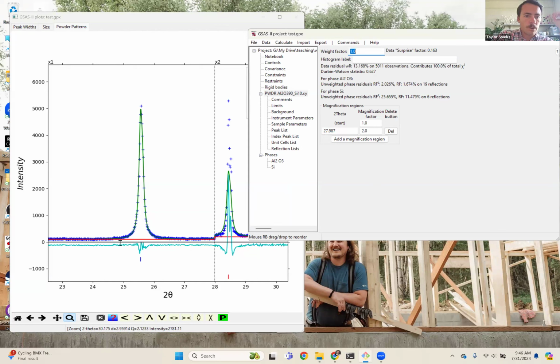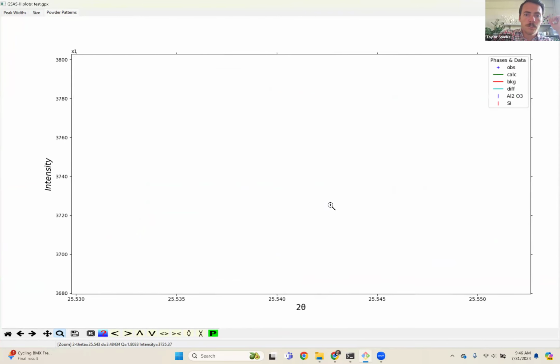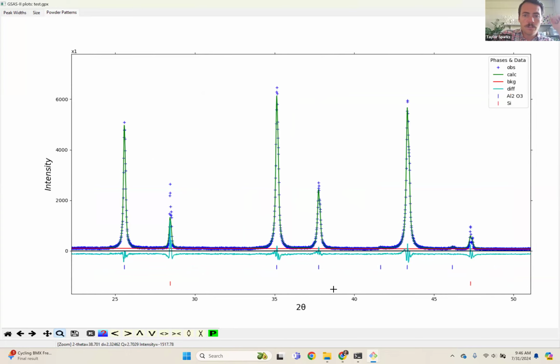All right. Other question I see: do you single click or double click to come back? On this profile, if you want to go back, I don't think double clicking will do it because you can just keep on zooming in. It'll just zoom in to some arbitrary limit maybe. To go back, I'm hitting this home button at the bottom. And you have to actually hit the magnifying glass. If I try to draw this, it doesn't actually work until I hit this magnifying glass. And then it will allow me to zoom in on different regions and look at them.